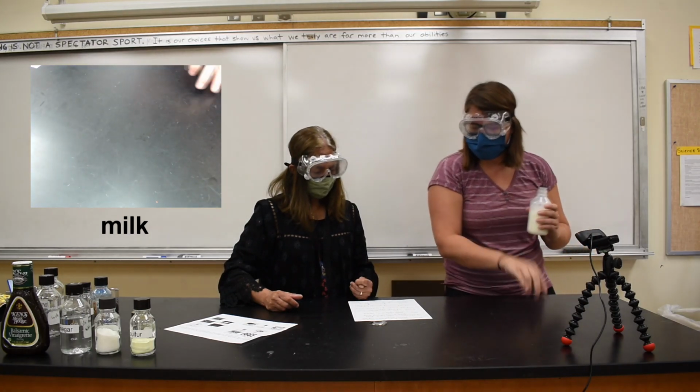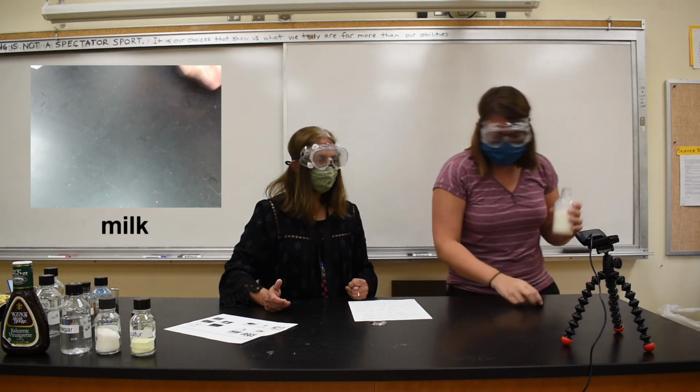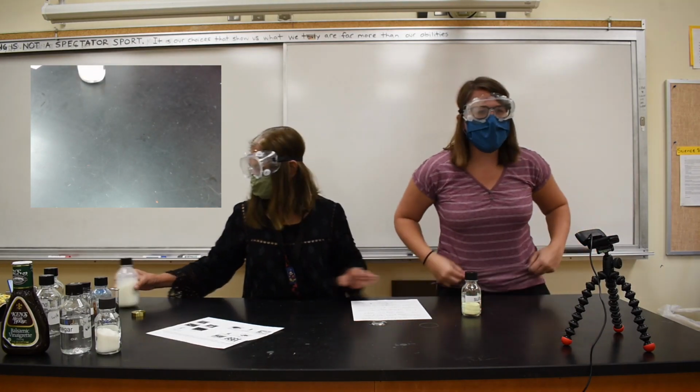It's going to smell like milk. And now it's probably going to make you all want to go get some cereal. Eat your breakfast. Or your lunch, depending on when you're watching this.